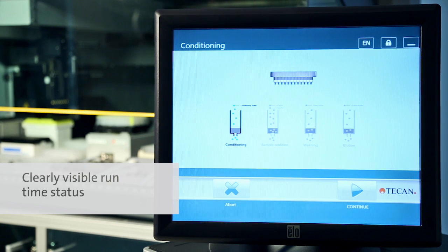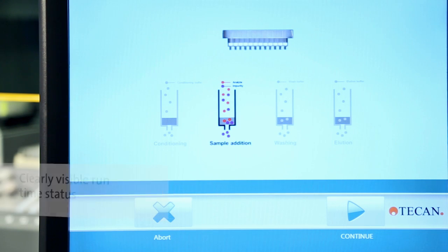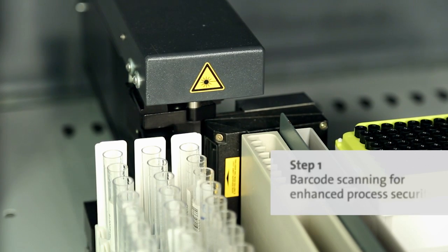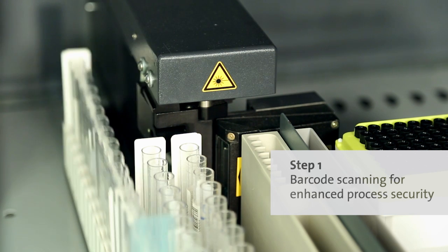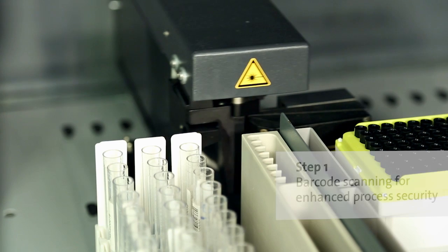Customizable real-time status displays keep you informed at all times. Automated barcode reading of sample tubes or plates provides you with complete process security and enhanced troubleshooting capabilities.